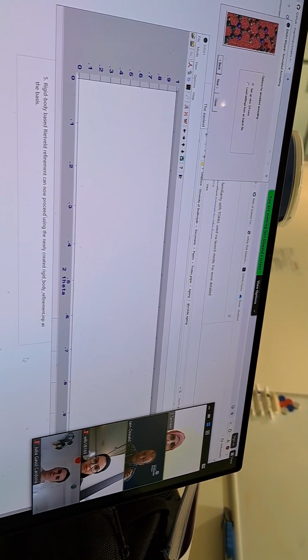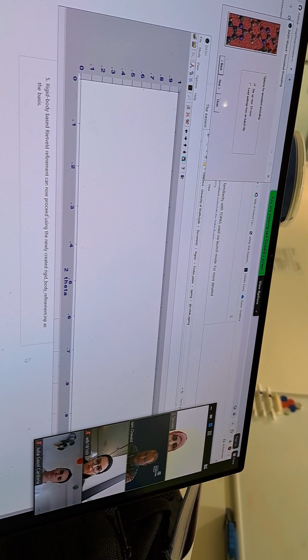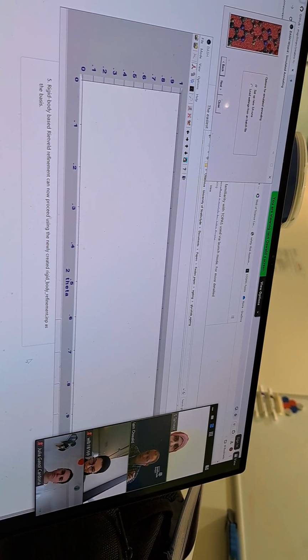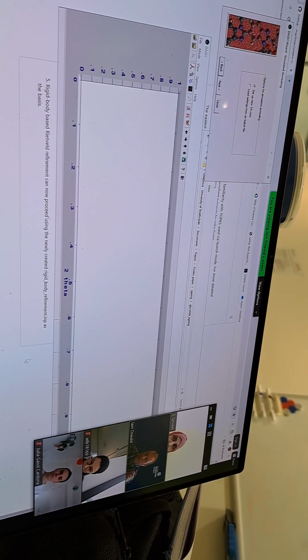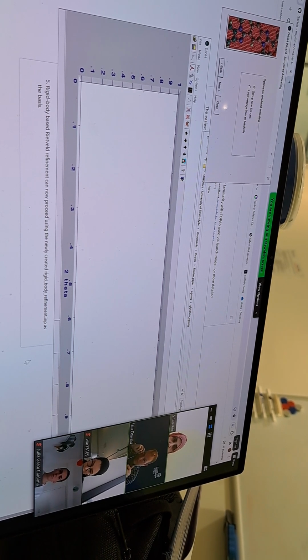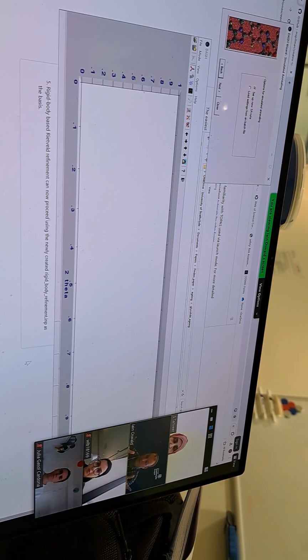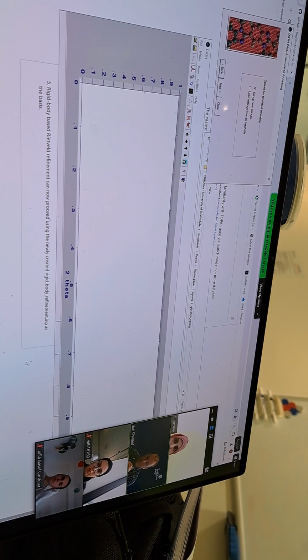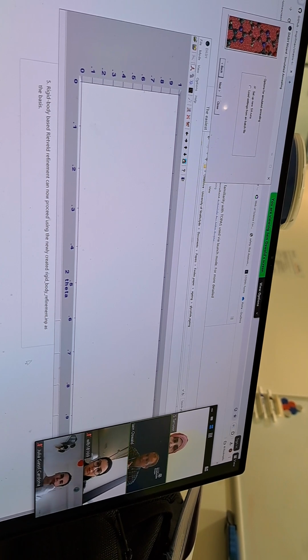These are the A to B bonds, these are ABC angles and torsions. The molecule is not going to move away from that, really. There may be a torsional angle here or a twisting around a bond, but the bond lengths and angles are going to remain. So please just use this model and fit the model as best you can to the data that we've got.